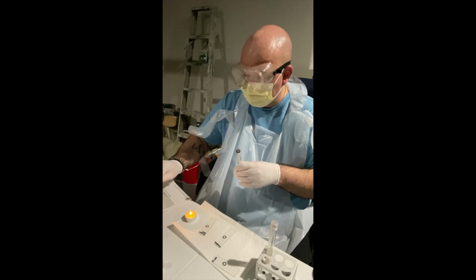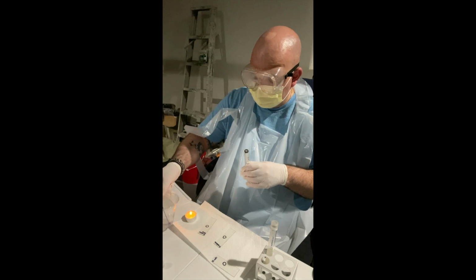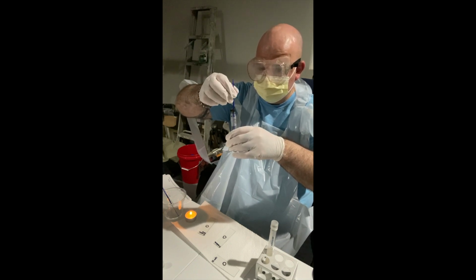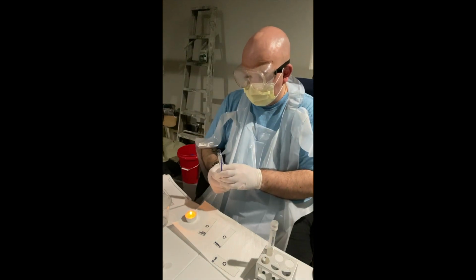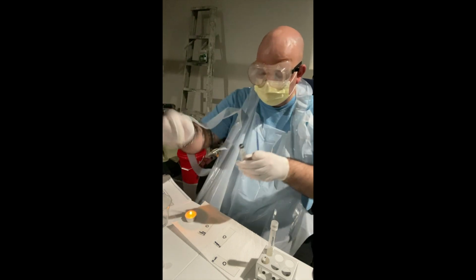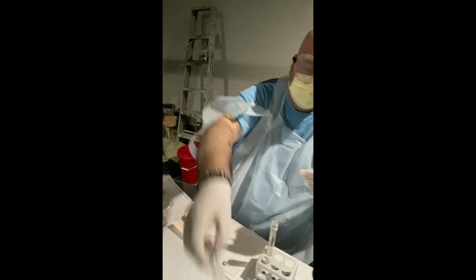Okay, so sterilized inoculation loop. Just kind of banging on the side of the cup here. Okay. So straight down into my sample. Just trying it for a second here. Straight back up. The lid of this, the tip of the tube gets flamed. Okay. Lid on, and then I'm going just again to set this aside.